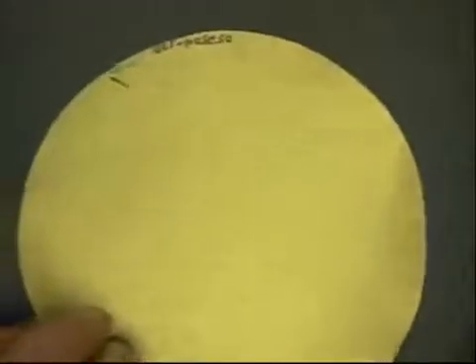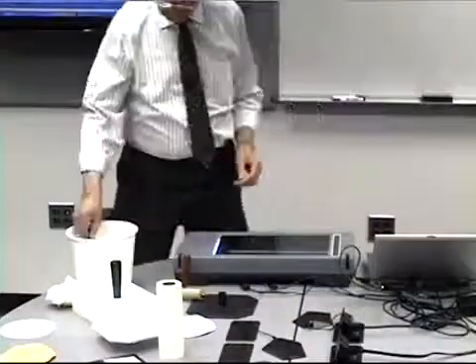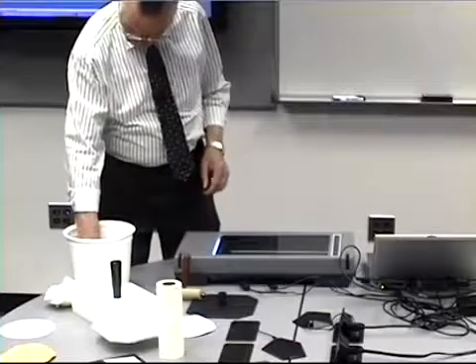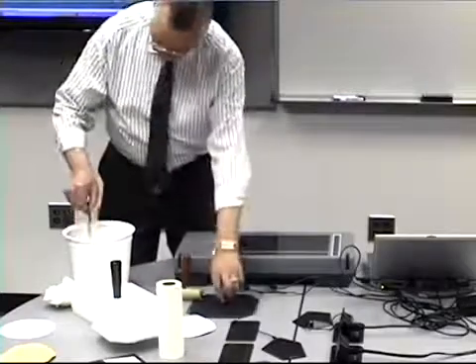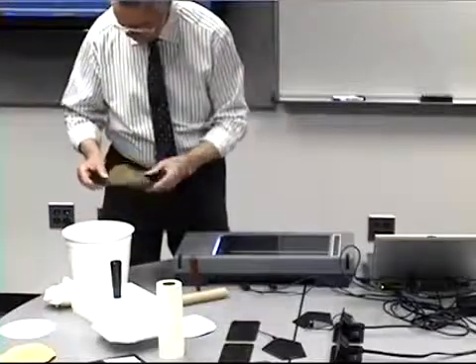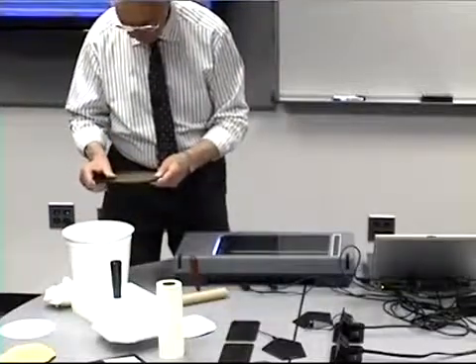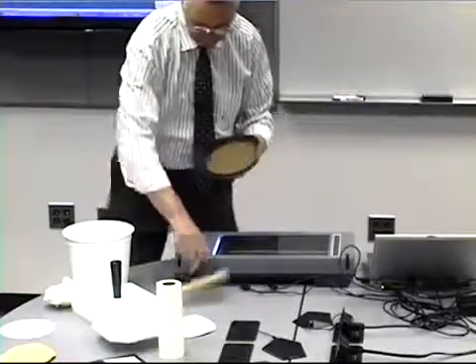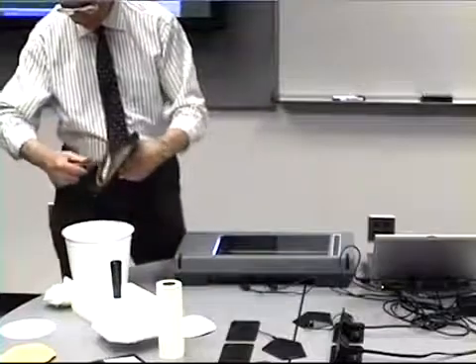It is fairly uniform. But when we take this same hand sheet and we dip it in water, and roll it out, you're using a black plate this time instead of white.